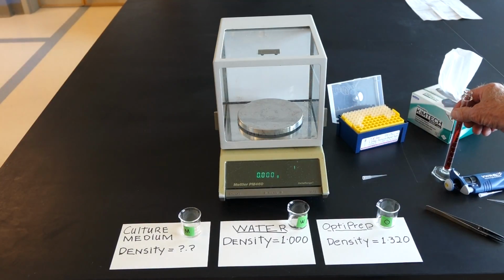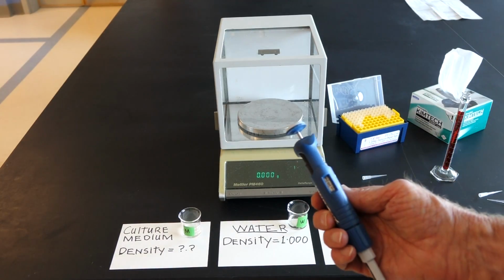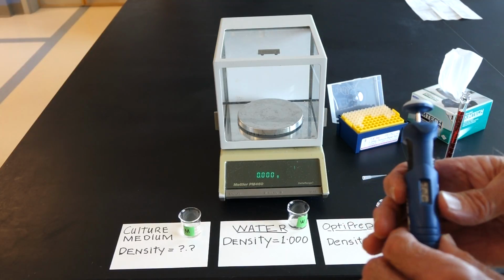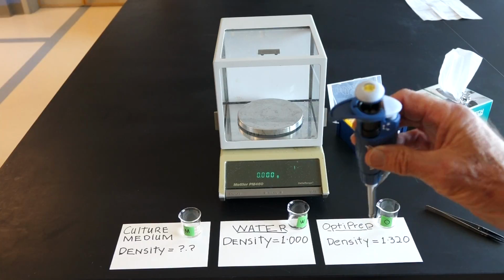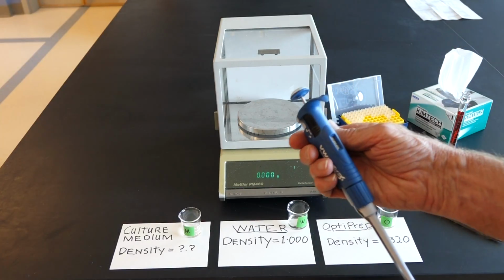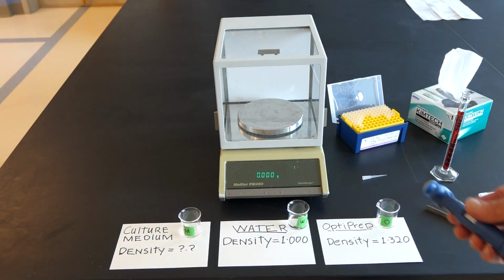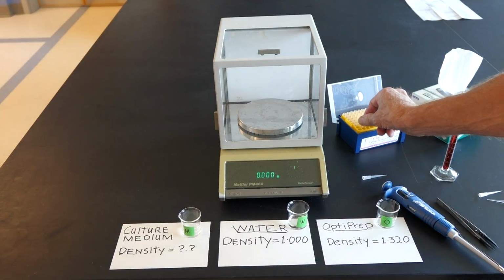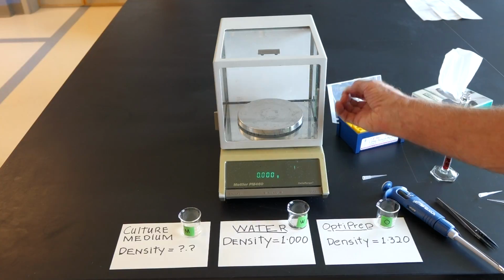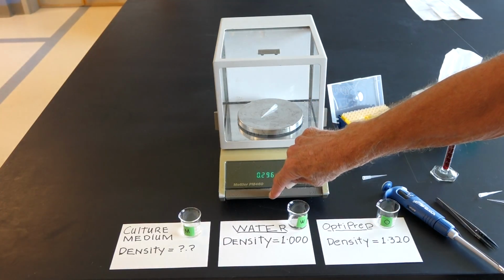You find a good micropipette in the range of, this one's in the range of 20 to 200 microliters. And I've set the micropipette at 100 microliters. Then I take a fresh plastic micropipette tip, I place it on the scale pan and tare it to zero.